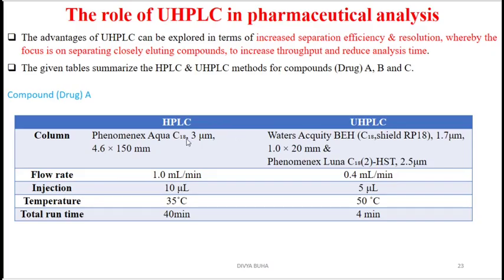Over here, 18 represents that the molecule which is being used as a stationary phase would have a long chain of carbon, and there would be 18 carbons in that long chain, okay, and these carbons would be bonded to the silica particles. So that's why it is referred to as octadecyl silane columns.